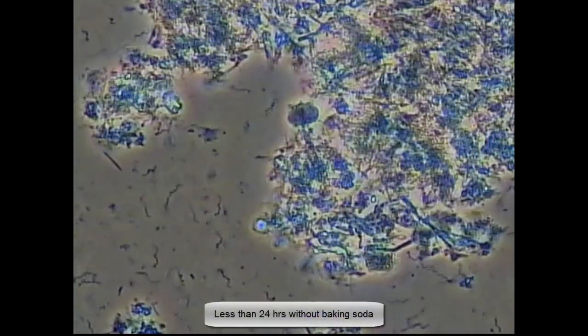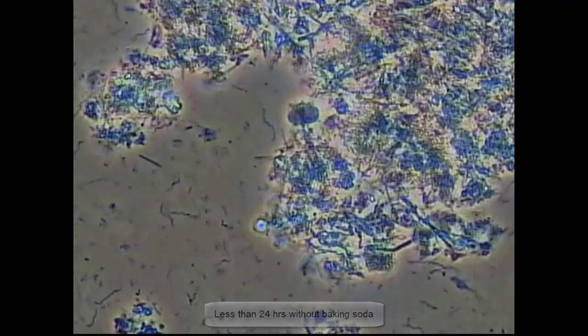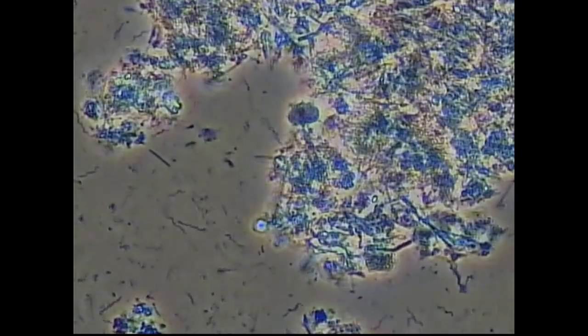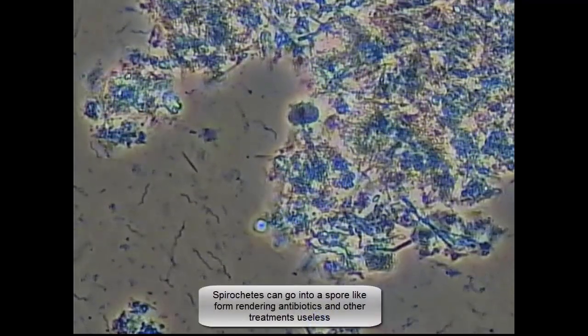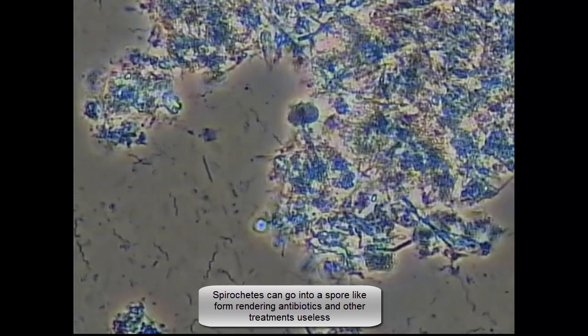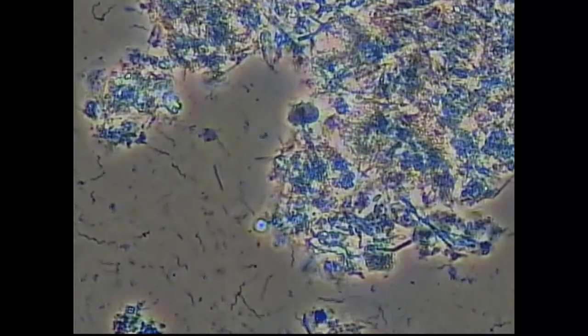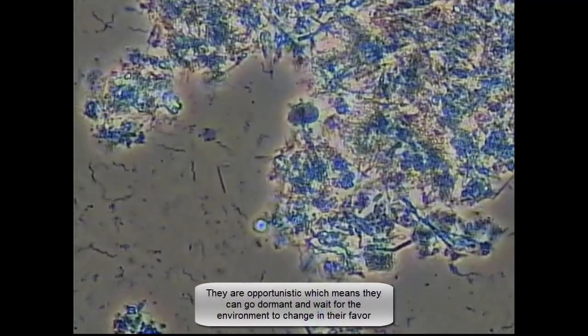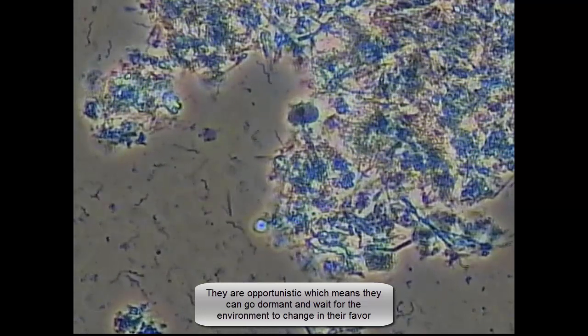She comes back in less than 24 hours. We take a slide sample as she's gone back to the regular home care she had before. The spirochetes, which appeared to be conquered, have indeed returned. You have different motility, different thicknesses, different lengths, different coils — all sorts of infection going on here.